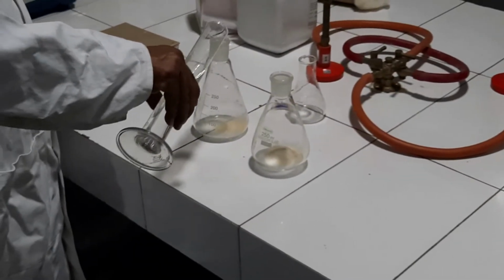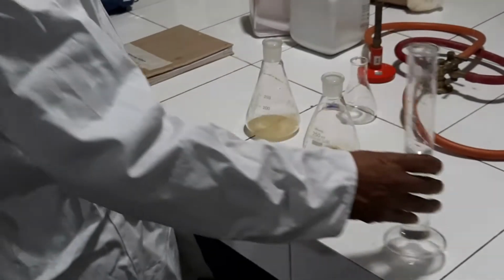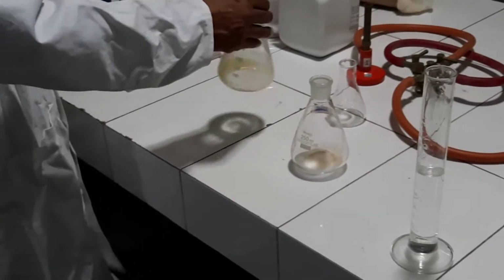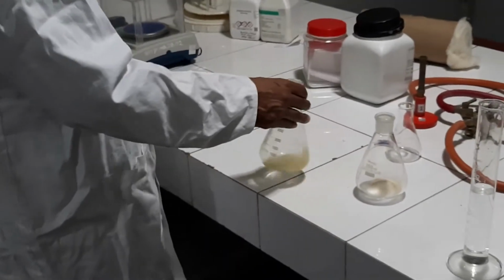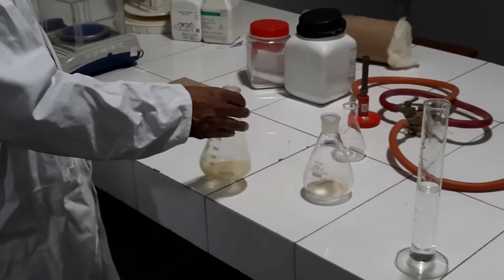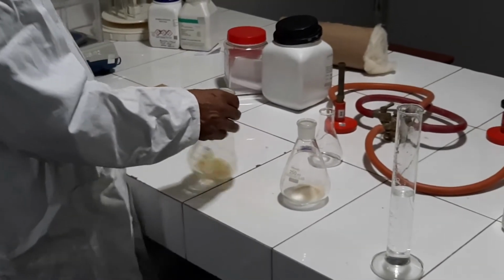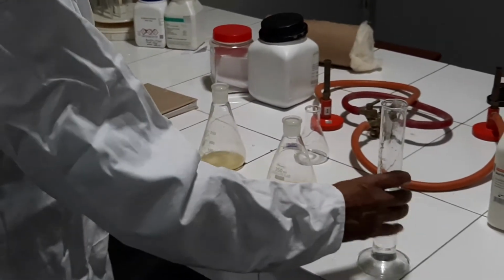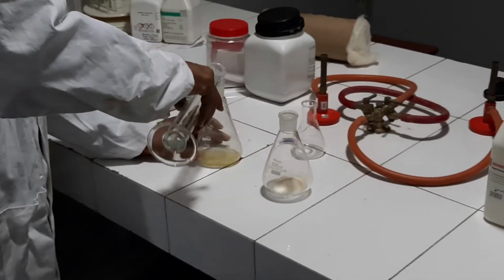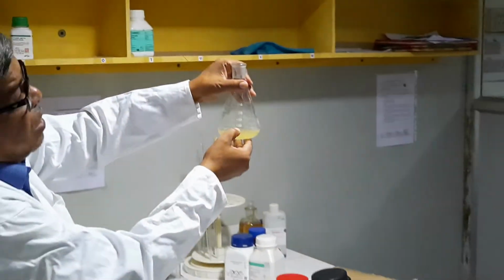I am adding a little bit of distilled water and dissolving the ingredients. This is for liquid media. What are the ingredients? Peptone 1 gram, sodium chloride 500 milligram and beef extract 500 milligram. You see, here is a mark for 100 ml.